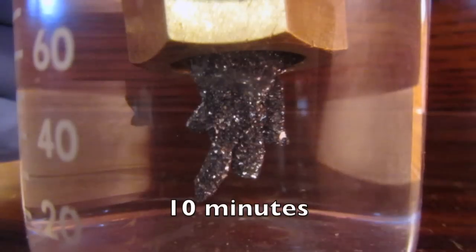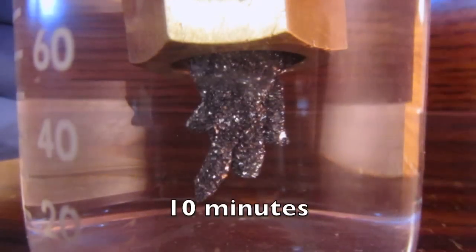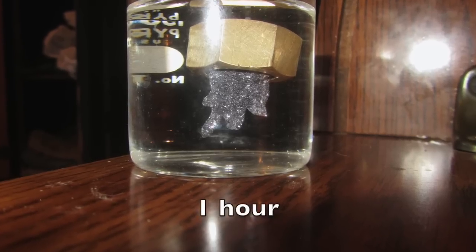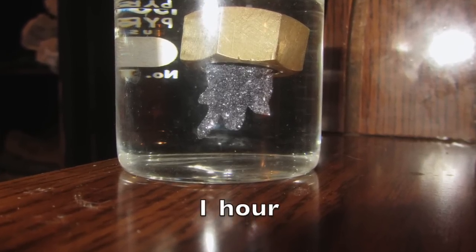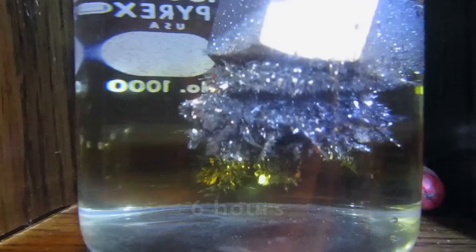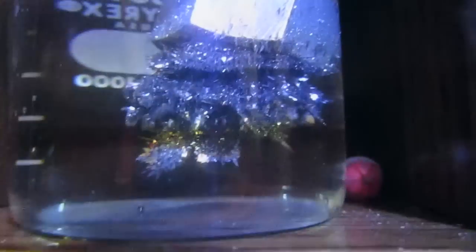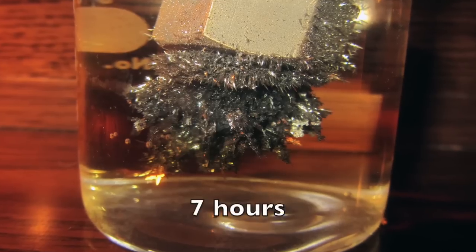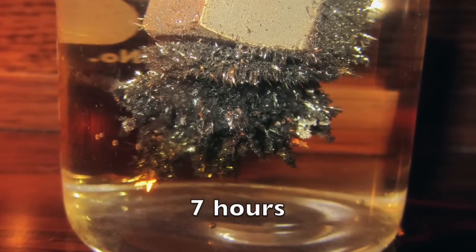This is called a single displacement reaction. What's happening here is lead acetate is reacting with the zinc to form zinc acetate and elemental lead, which deposits in the form of small crystals that over time grow out to larger crystals and form a branch-like, tree-like shape. That's how it gets the name tree of lead.